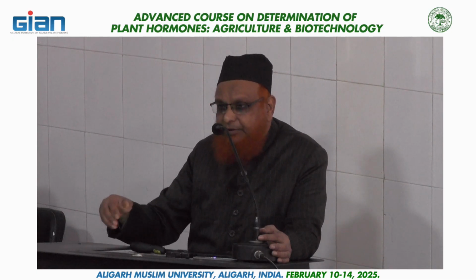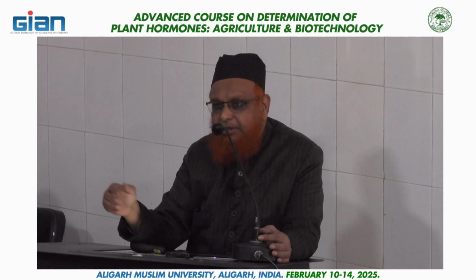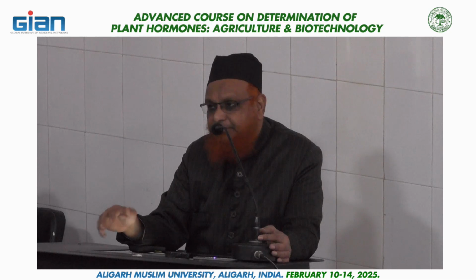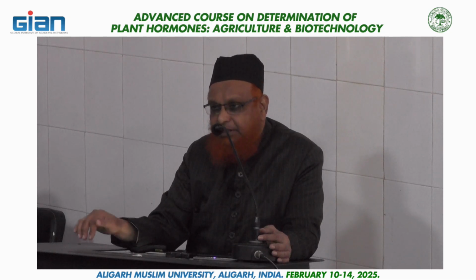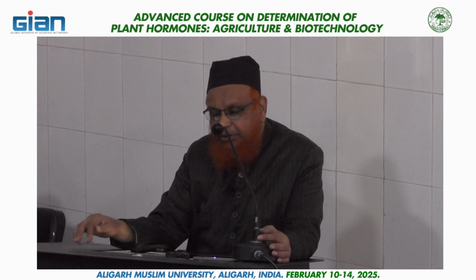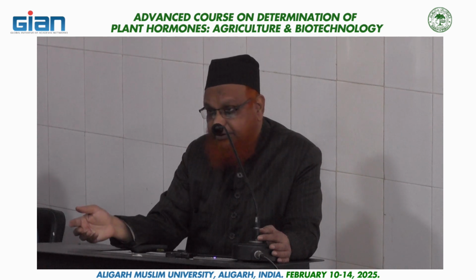So after each 5 minutes, we take a sample of smoke water and read the optical density, and a time will come when no more smoke will be dissolved in water. So this is called SSW. When the optical density is not increasing, it means that the double distilled water is fully saturated with the smoke. Okay. Now you can use this SSW, that is smoke saturated water, for your experiment.